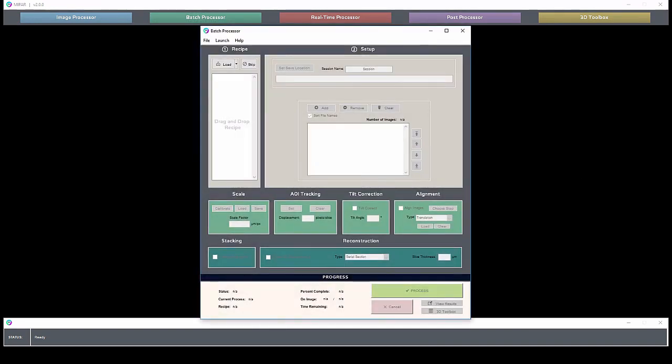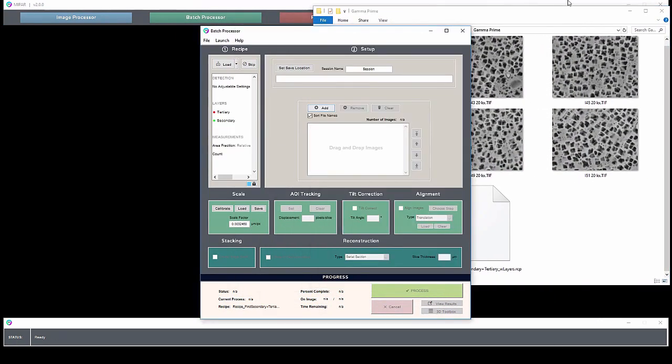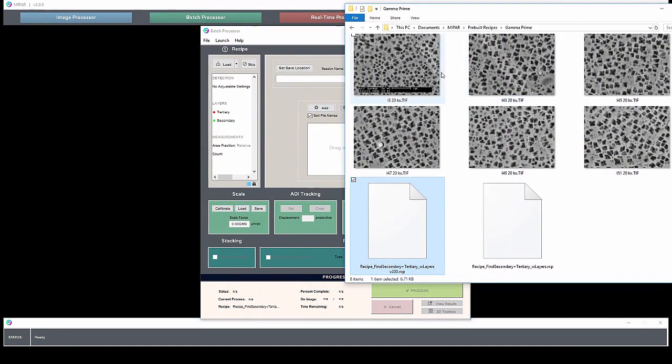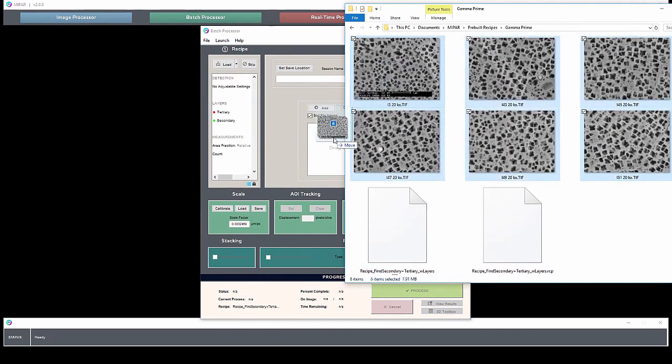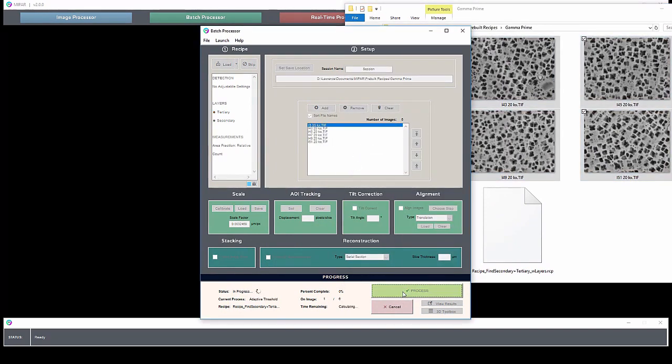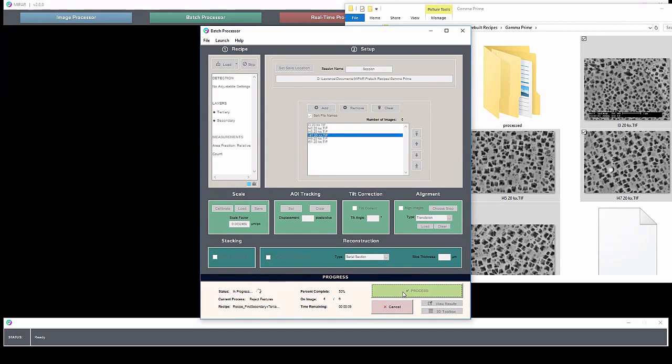As we wind up our introduction to MyPAR, I want to just briefly introduce the batch and post processors. Once you have your recipe developed, you can apply it to a large number of images in the batch processor. Simply load them in, like so, and hit process. Now I recommend doing this during recipe development as well as after, so you can check each chapter and make sure it works for all of your images before moving on to the next chapter.